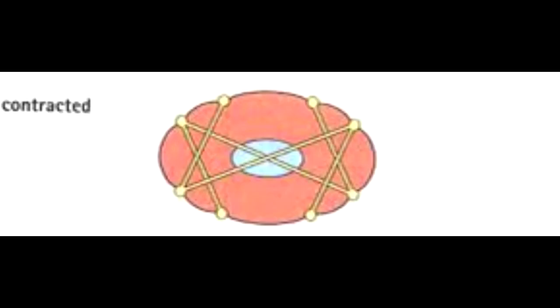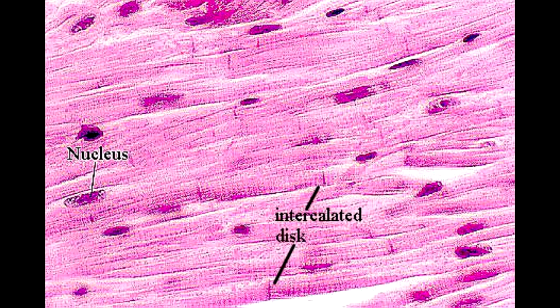To summarize, skeletal muscle is striated with multiple peripheral nuclei. It is arranged in long fibers and there are satellite cells which allow for some regeneration. Cardiac myocytes have a single central nucleus. They are branched and are connected at intercalated discs. This time, however, they have very little regenerative capacity. Smooth muscle, as the name suggests, has a non-striated appearance. This mononucleated cell, unlike cardiac muscle, has very good regenerative capacity.